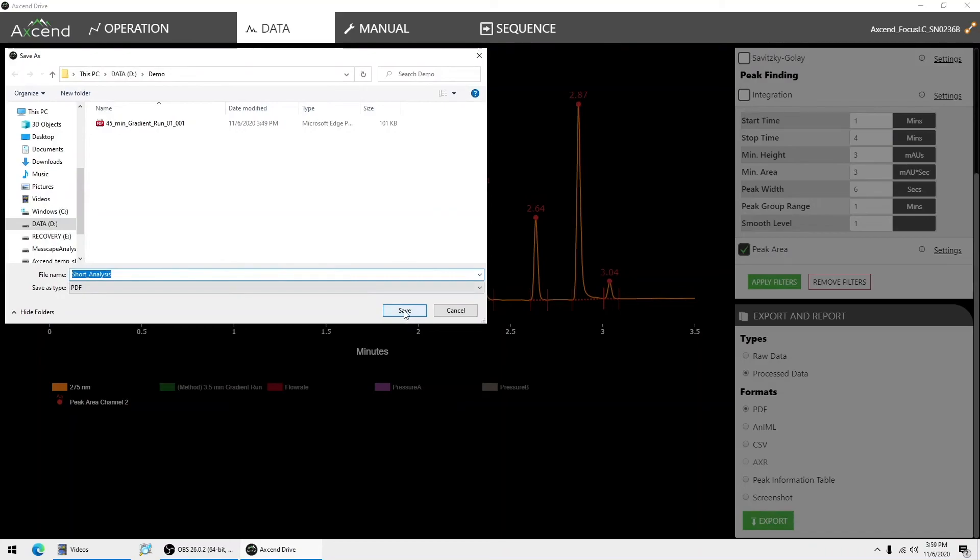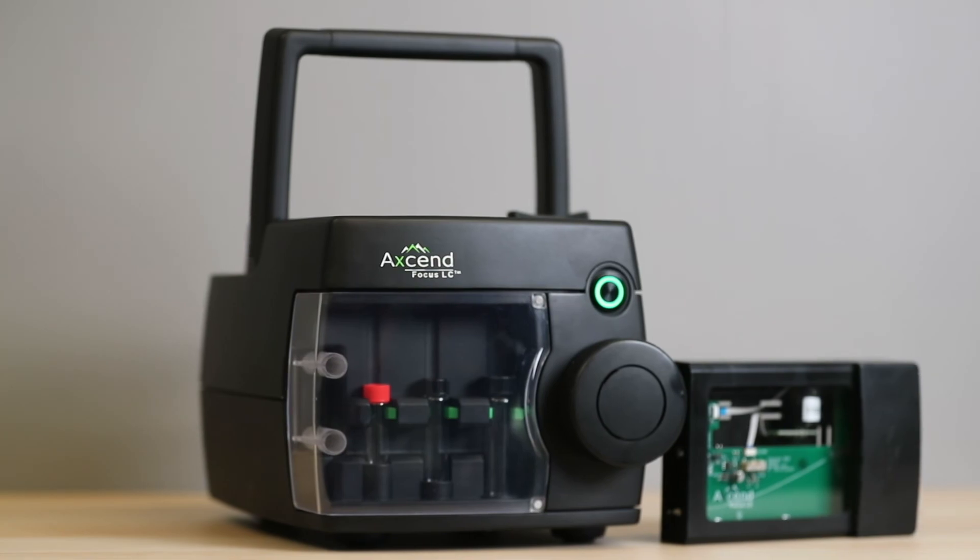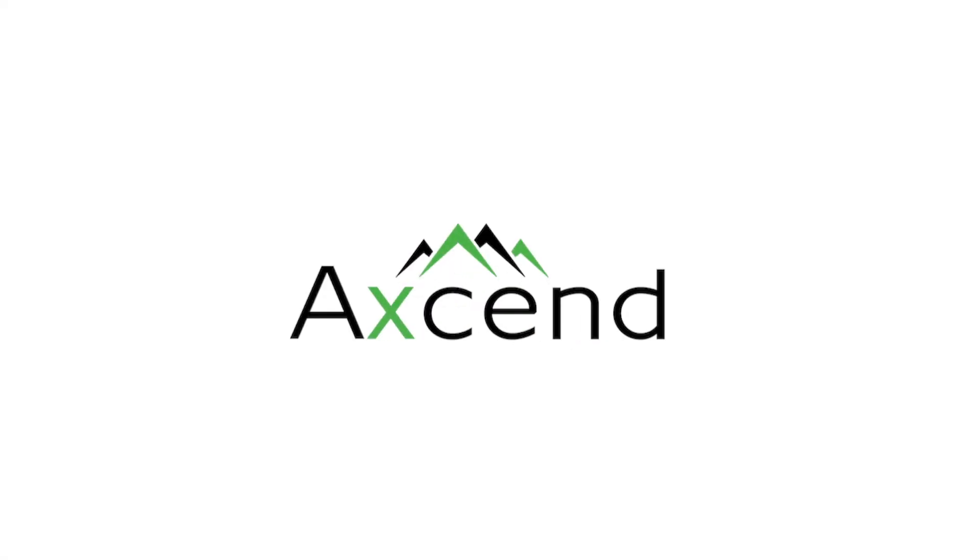To summarize, this innovative XenFocus LC makes HPLC anywhere a reality.